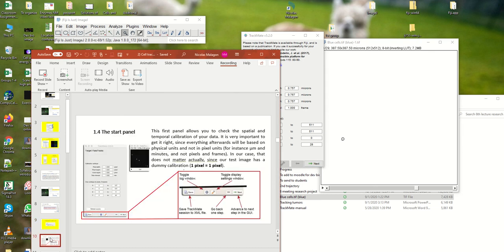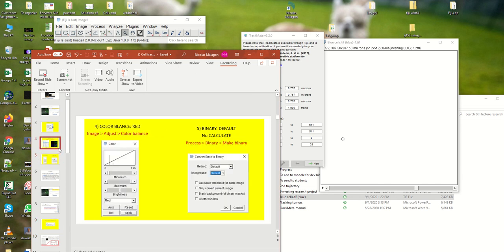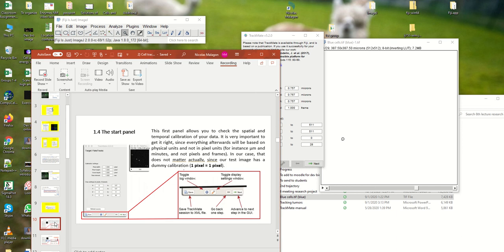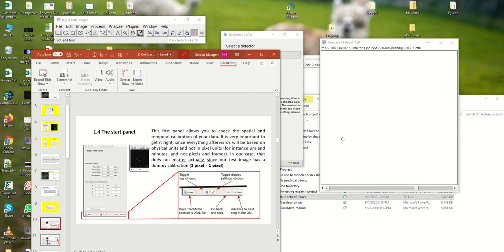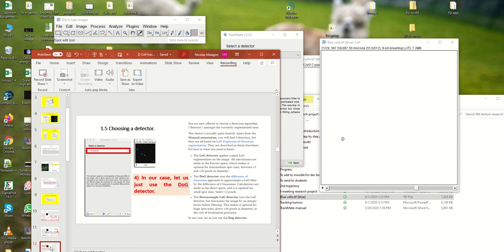Okay, and this in yellow I put the things that are new. So these are the new things. And the white things are things that you already know from the previous video. So here you just go next. This is the explanation that you already know.